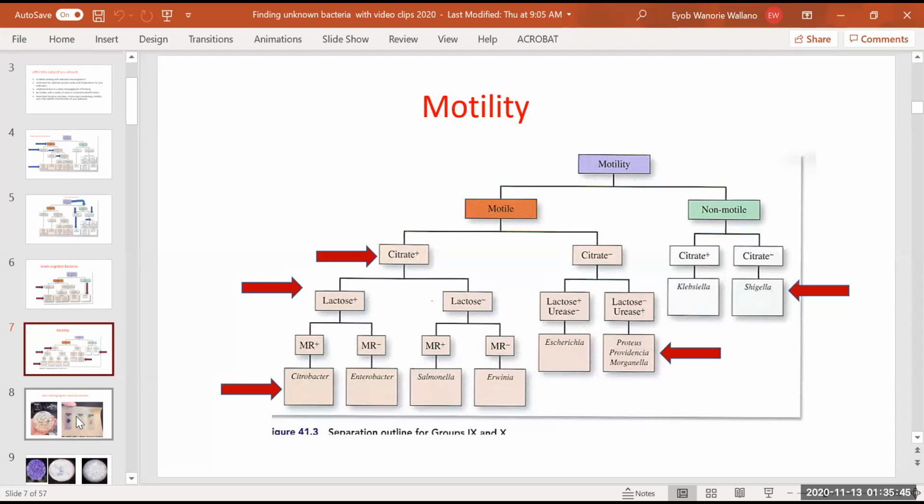So in gram stain, we are going to separate gram positive and gram negative, and then spore forming and non-spore forming, and then when we come to acid fast, we are going to say acid fast and non-acid fast. Generally, acid fast bacteria are gram positive bacteria. You know it. In the past, we were using it like that. Even in certain literature, all bacteria were classified by two cell wall structures, gram positive and gram negative.